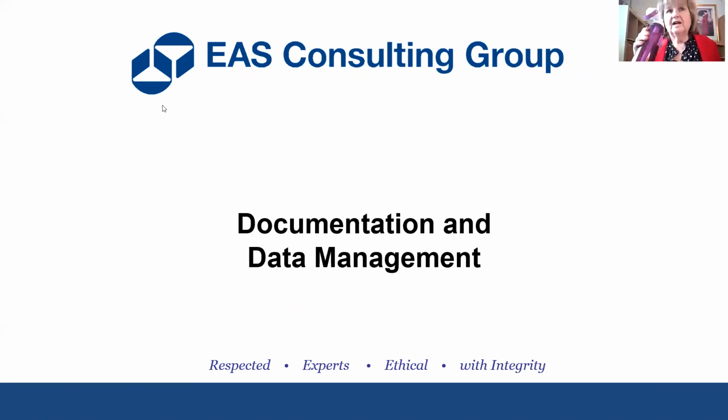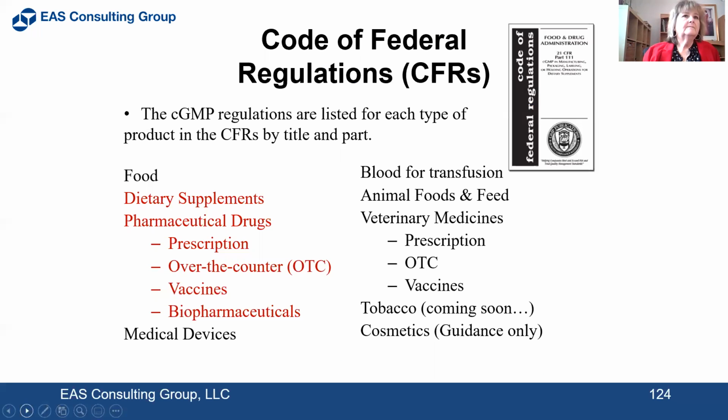Now we will go over documentation and data management. So here's that list of all the regulations for the different industries that the CFRs cover. And then most of our presentation will be around dietary supplement and pharmaceutical drugs.